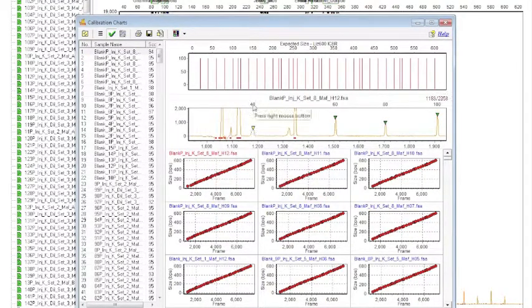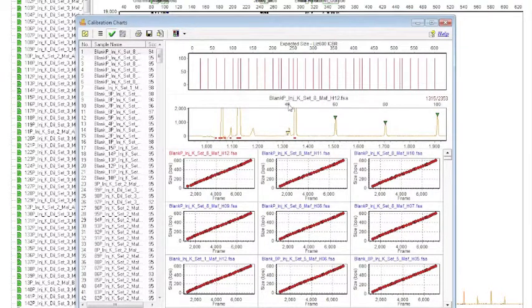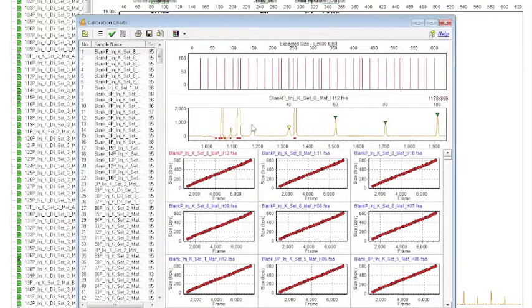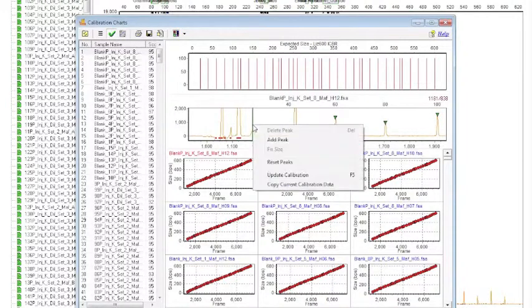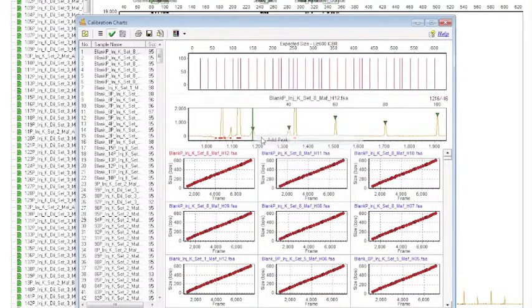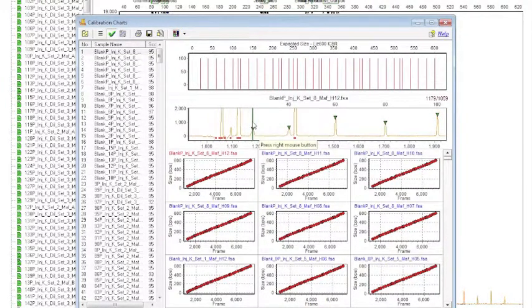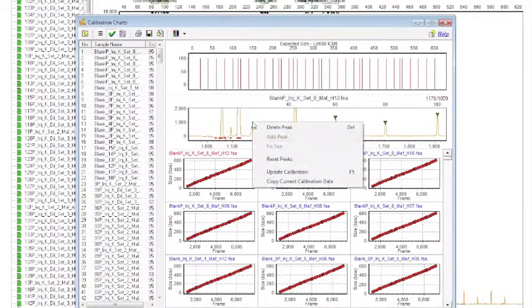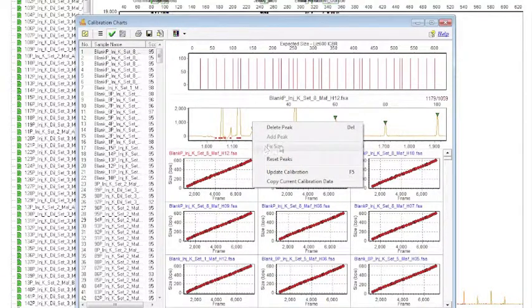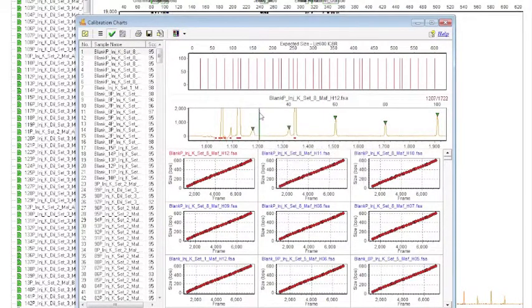So it turns out that if you right click here and add a peak, what you couldn't do before is right click and fix size. See how that's gray? You wouldn't be able to do it.